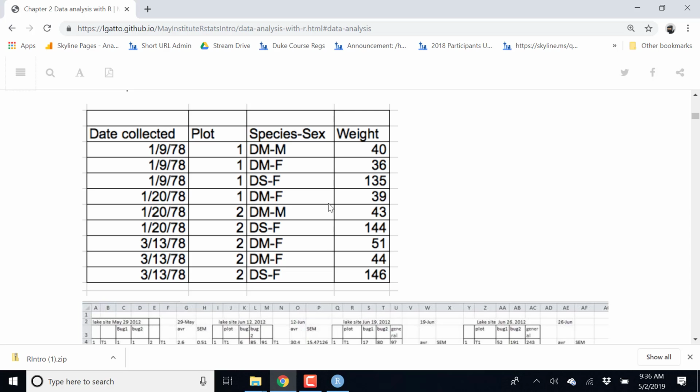So for example, let's assume that this column here is some sort of intensity that was measured, maybe peptide intensities. Well, if I want to look at all the intensities or the distribution of intensities, it becomes straightforward. I extract that column, and that column gives me all the intensities of interest in that data. So that's the kind of reasoning, the kind of subsetting that we will need to be able to do easily and quickly to proceed with our data analysis.